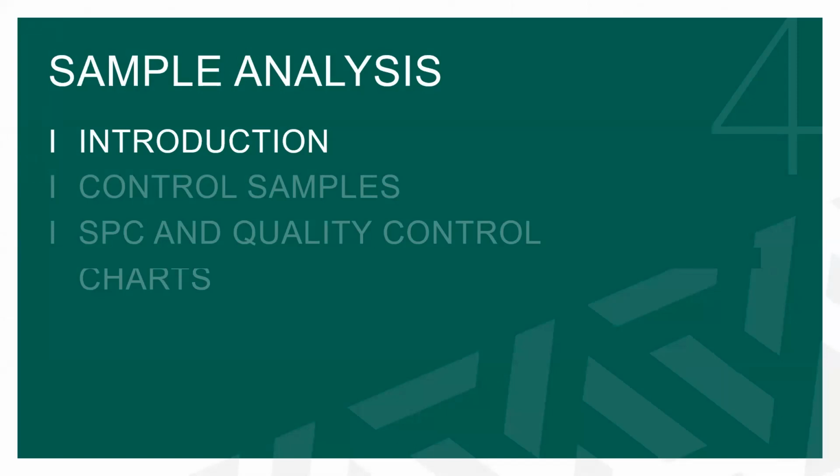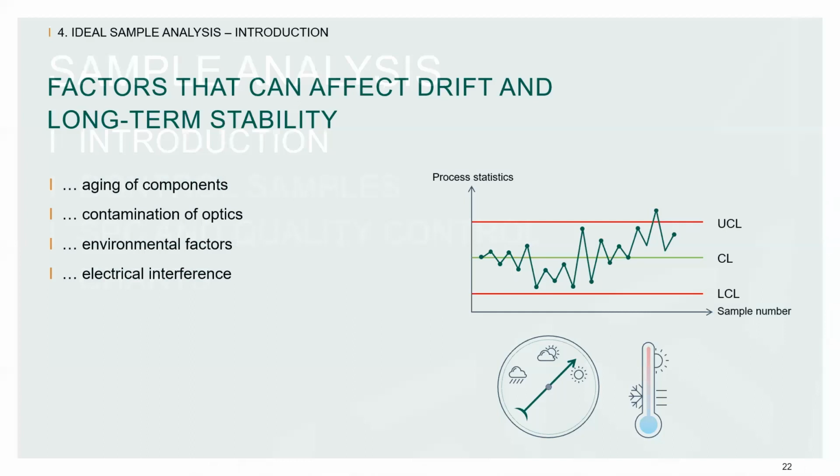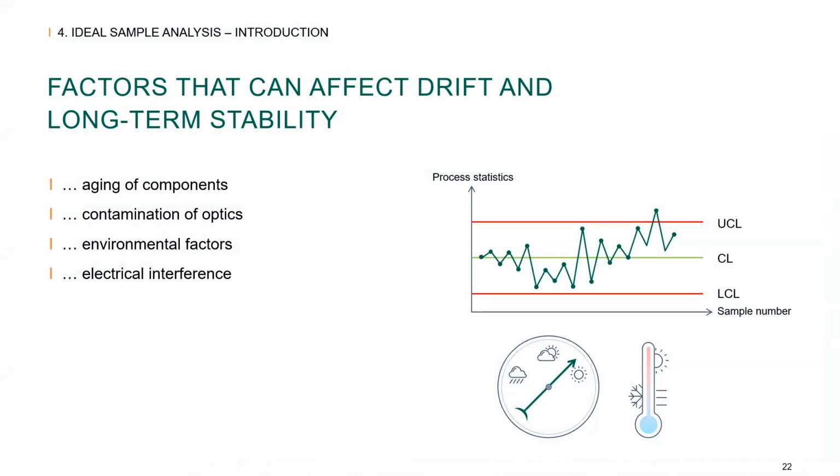So, with sample analysis arises many questions, such as, why does OES need to be analytically checked? What is recalibration? When should I perform a recalibration? How do I correct for deviations within my results? There are many factors that require you to check or recalibrate your instrumentation.